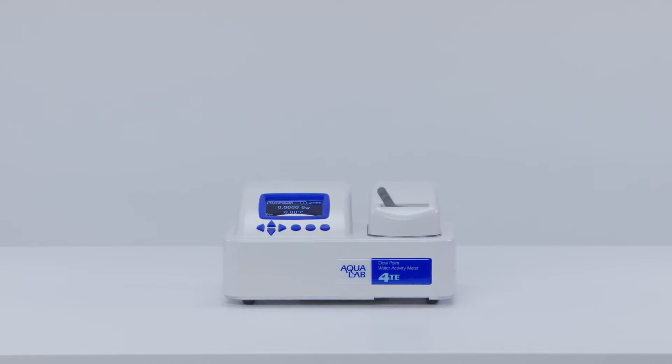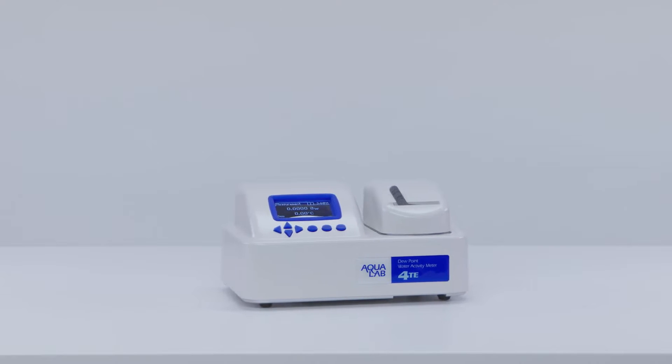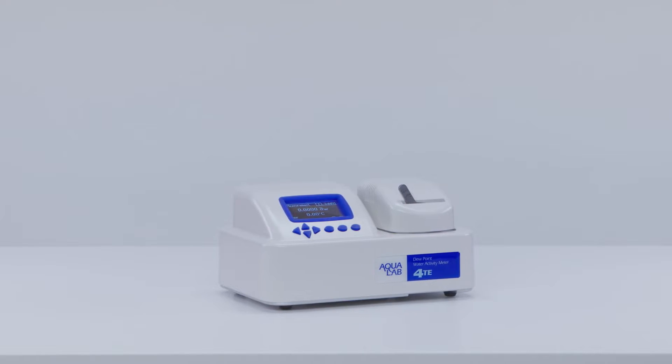This is our most popular water activity meter, and it's the choice of about two-thirds of our customers that buy water activity meters.